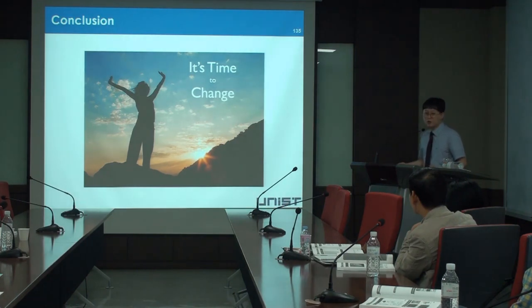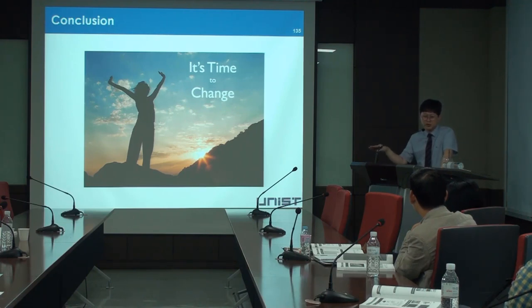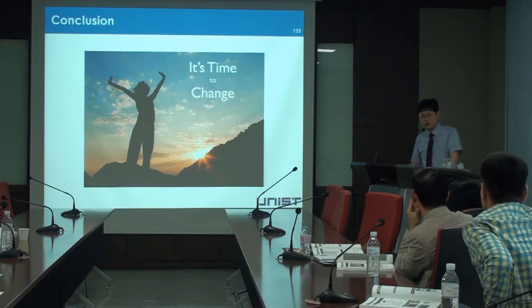So my conclusion is it's time to change. So far we have depended on HRMS, but it's suitable for very rich countries, rich instruments, institutes and universities. But for general universities or institutes in many countries, the price, operation cost and training of personnel for HRMS is not easy. In those cases, you can shift into a GC-MS/MS system or other systems.